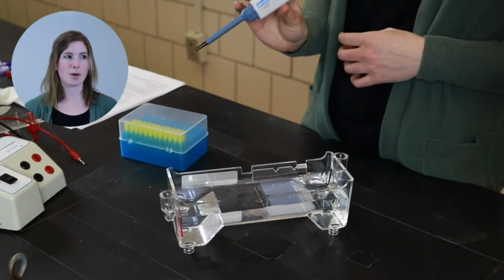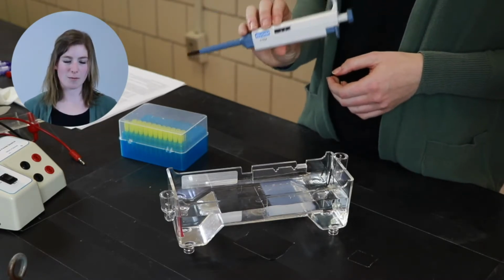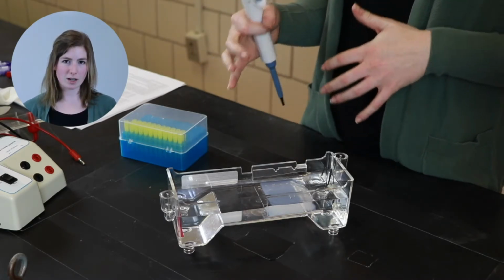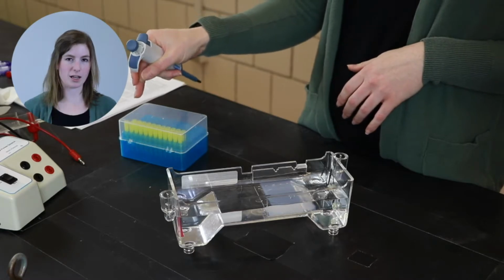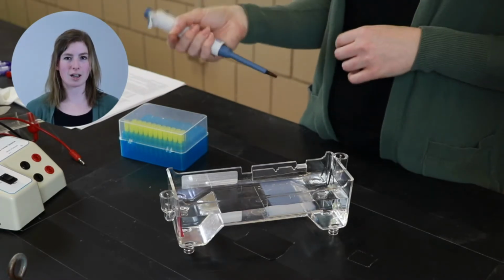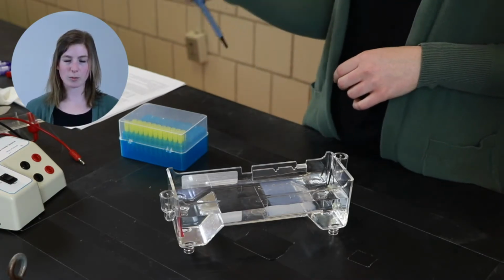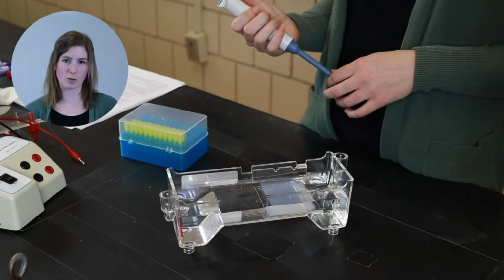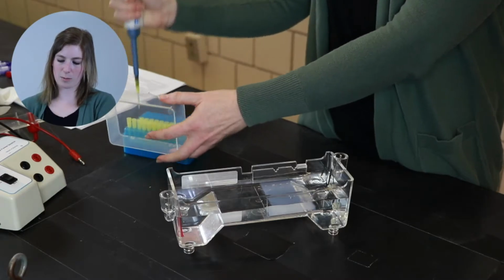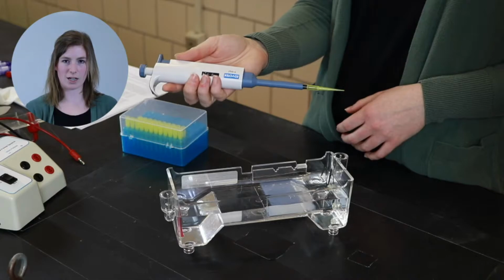I have my pipette set to 35 microliters already, and that is the amount that I'm going to put into each of the wells. What I want to be careful of is when I put a tip onto my micropipette, that I use a different tip each time I get a new sample. I don't want any cross-contamination. So I'll use a separate one for each of my 5 samples that I'll be loading. So I'm going to go ahead and put a new tip onto my micropipette. So this is what it would look like when I'm getting ready to get my sample.